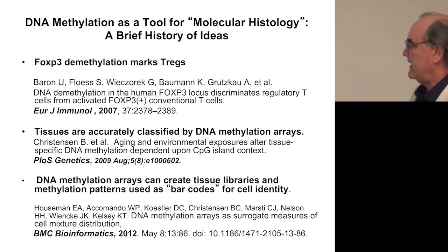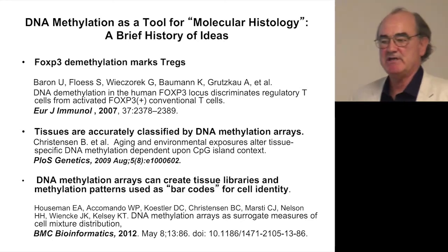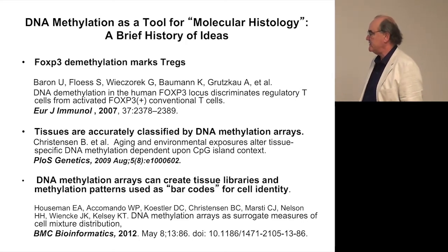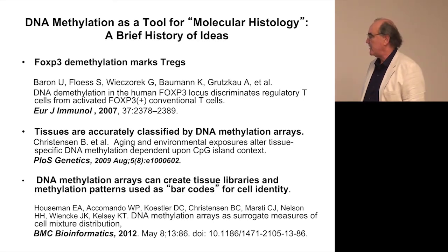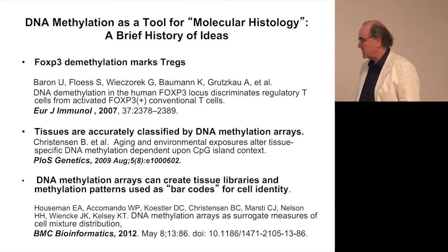I'm just going to mention, in case you are interested, there is a mathematical problem. It was a difficult problem in terms of the arrays that had to be overcome: if you have these patterns of cells all mixed together, how do you disentangle them to get counts and come up with profiles? It was solved by our mathematician, who's now up the road at Portland, Andy Hausman, and it was published in BMC Bioinformatics a couple years ago.